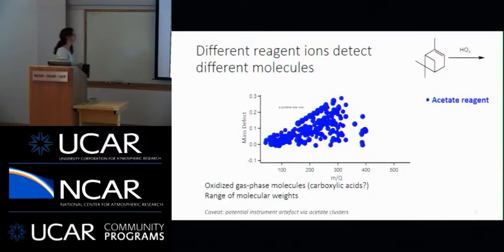So if we take an experiment where we took alpha pinene, reacted it with OH radicals, and look at the gas phase composition a couple hours into the experiment, this is what we see in mass defect space. We see mass to charge ratio on the x-axis, mass defect on the y, and the spread of lots of dots. Lots of dots means lots of ions. So again, the groundbreaking idea that we have lots of molecules in the atmosphere when we do an oxidation experiment. But we can get a little more information out of this.